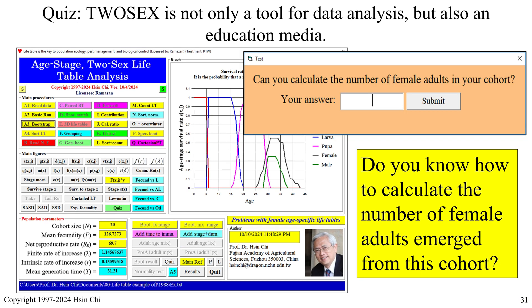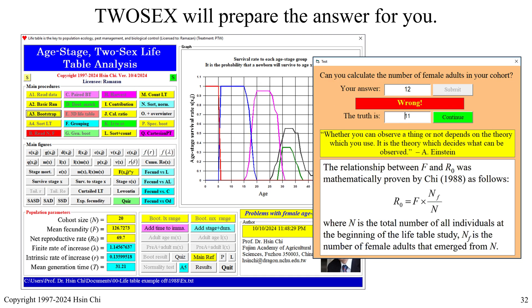If you see the quiz window, please read the question carefully, write your answer, and click the Continue button. The 2-Sex program is not only a tool for data analysis but also an educational medium. As Einstein said, 'It is the theory which decides what can be observed.' It is important that you understand the theory — only then can you correctly interpret your data in your paper.